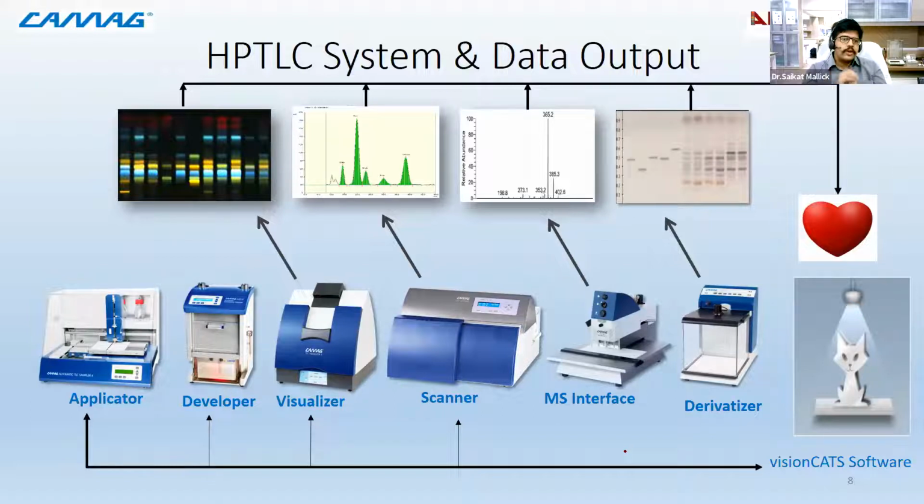We use the spray-on technology, that is the molecule is sprayed, so the drying time is also minimized, unlike the typical TLC format where you have to spot and wait till the spot dries and again respot it. So that problem is not there. Instant loading of that compound at higher concentrations is possible on the applicator.